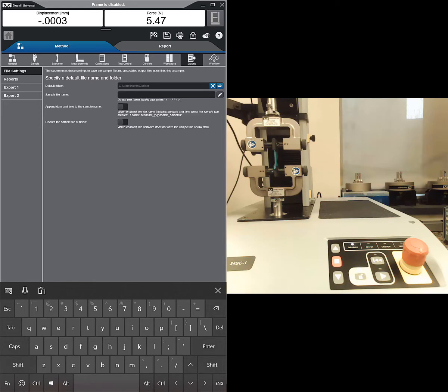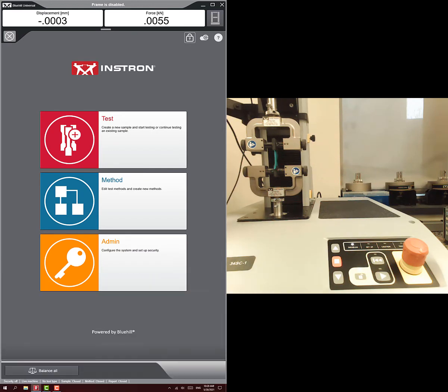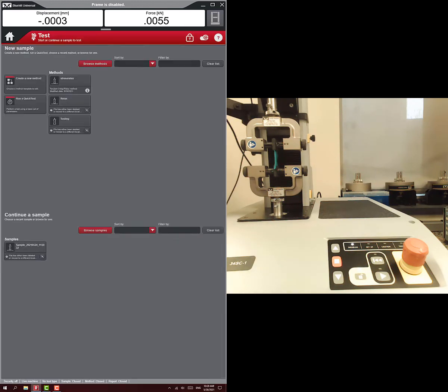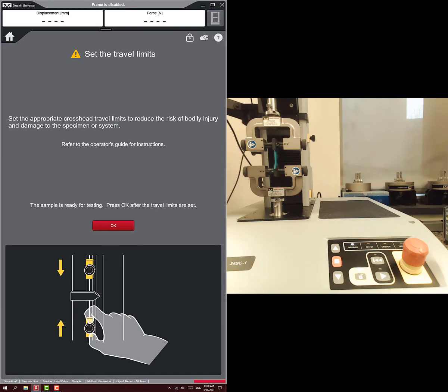Go home. And now we're ready to run the test. It's going to be very similar to what we did before. We're going to choose our stress relaxation method. It's going to tell us, make sure you set your limits, which we've already done. So we're going to hit okay on that.